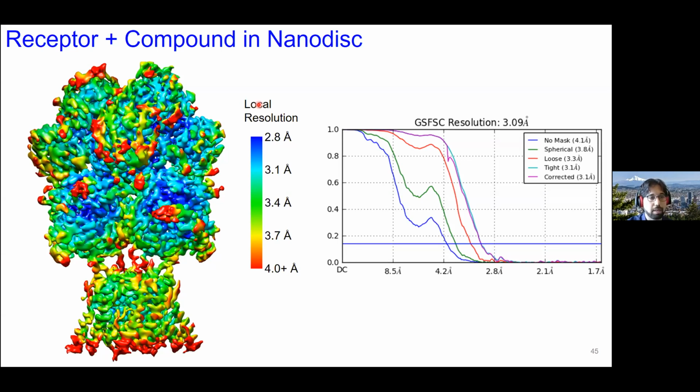So I think you might have to test it out and see what you see. Especially if you're using CryoSPARC, they've made this relatively computationally cheap, because I can classify 1 or 2 million particles into 8 different classes in less than a day on a single GPU, which is pretty fantastic.